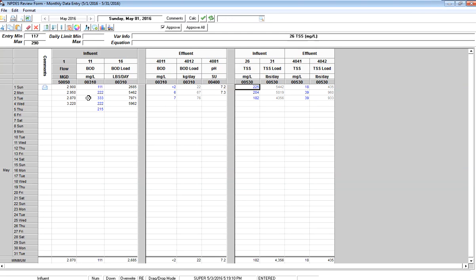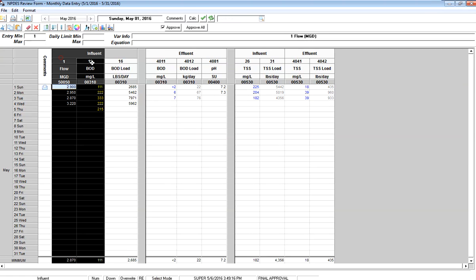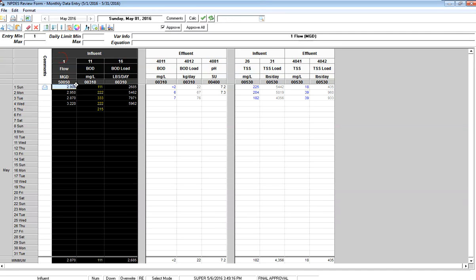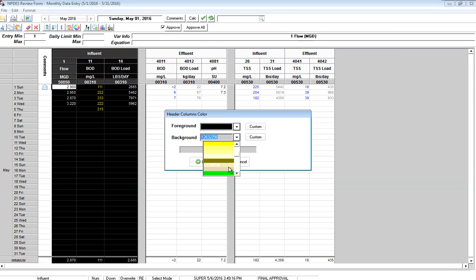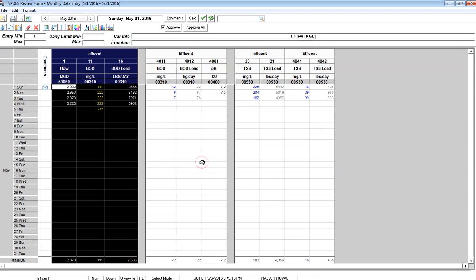Some other things I may want to do is set the color of these. Maybe on Influent, I want to go back into Select Mode, click and highlight all three of my Influent BOD, right-click and go to Change Header Color. In this case, I'll say that should be brown because it's Influent.